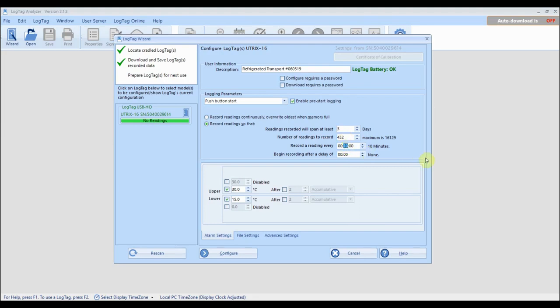Specify how often you want your logger to take a reading and the maximum number of readings the logger can take will be displayed.